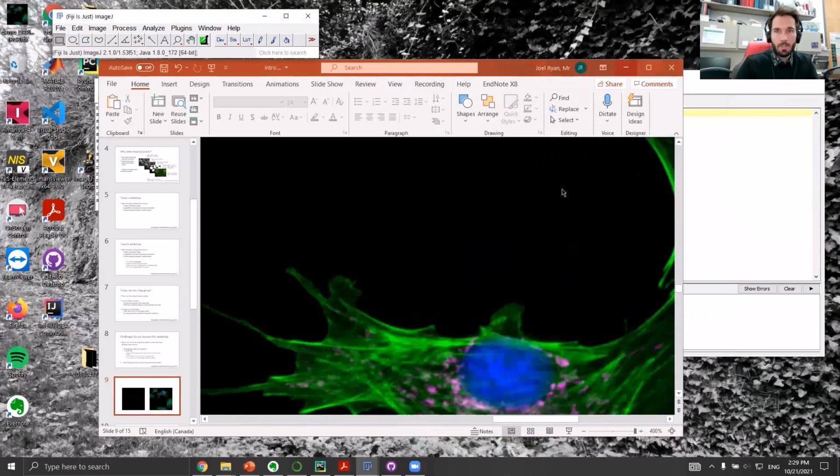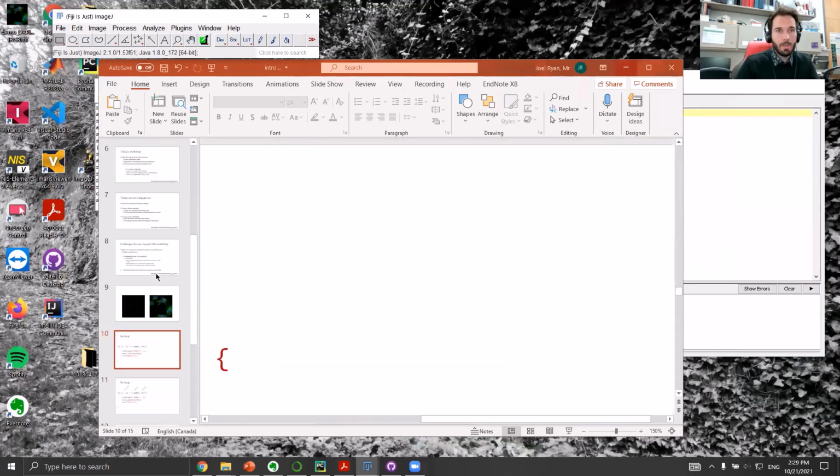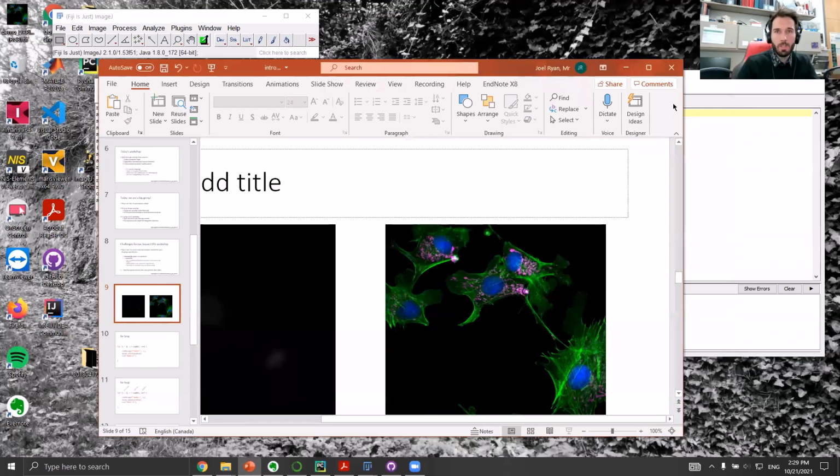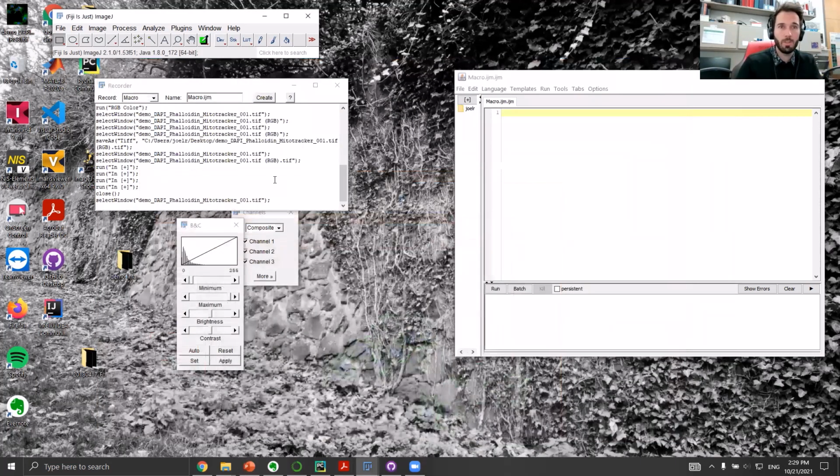So we generate that image. That's kind of nice. Now, one of the things that we want to do is streamline the processing a little bit. There are 2 things. One is that we did all that by clicking, and that was, I don't know, a dozen or 20 clicks on all the different menus.